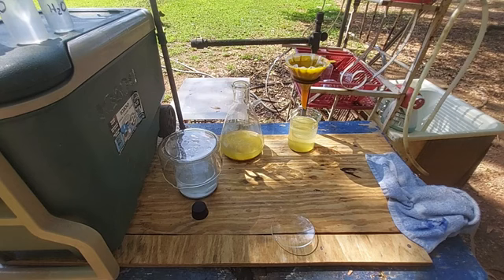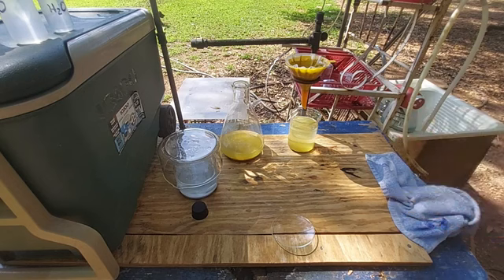Anyway, it's probably going to have to be with the beta-nitrostyrene, because I don't really have any other kind of nitroalkene that we can use, and I don't have enough benzaldehyde to make another one. I don't know. I guess you could use a substituted benzaldehyde. I wonder how that stuff that you use to drop out metals works. That's a thought. Put that on the back burner. Anyhow, back to the task at hand here.